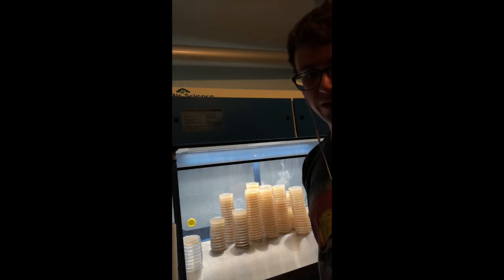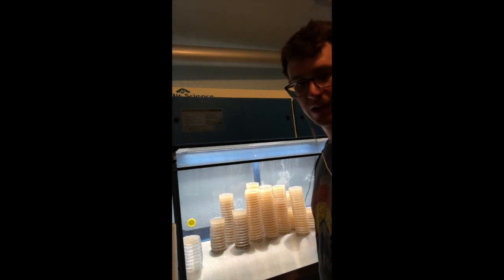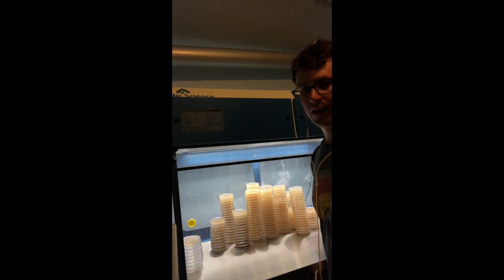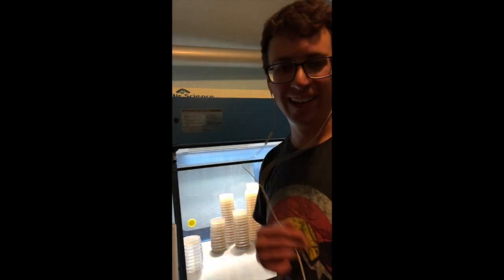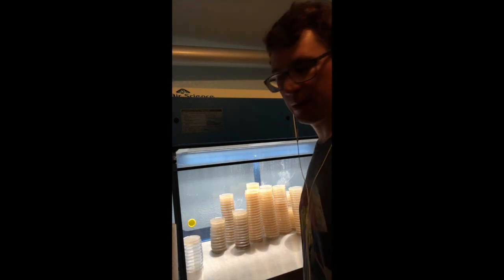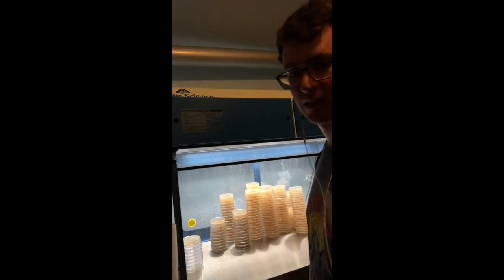So there you have it, 212 plates poured. There was a little bit of clumping at the end of these last two jars. That's why it's important to move quickly while you're pouring your plates. Normally I get those all done, but I was busy explaining things.